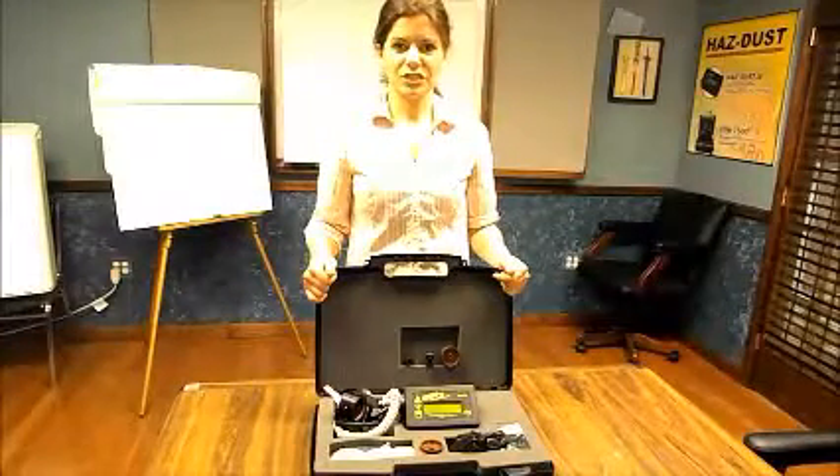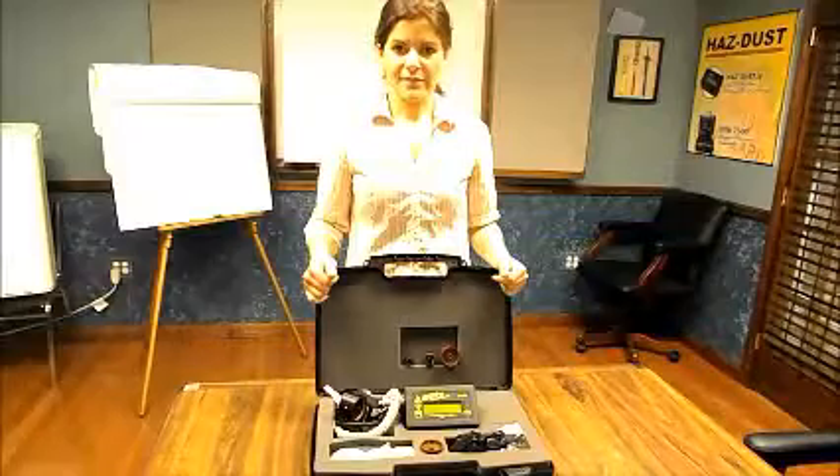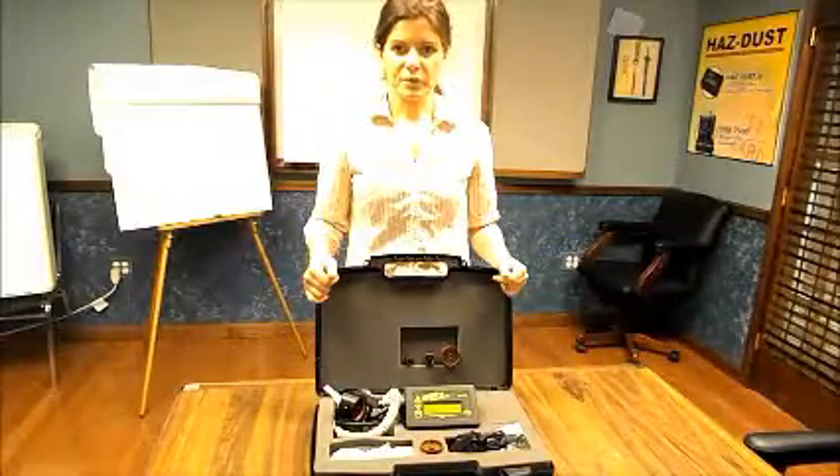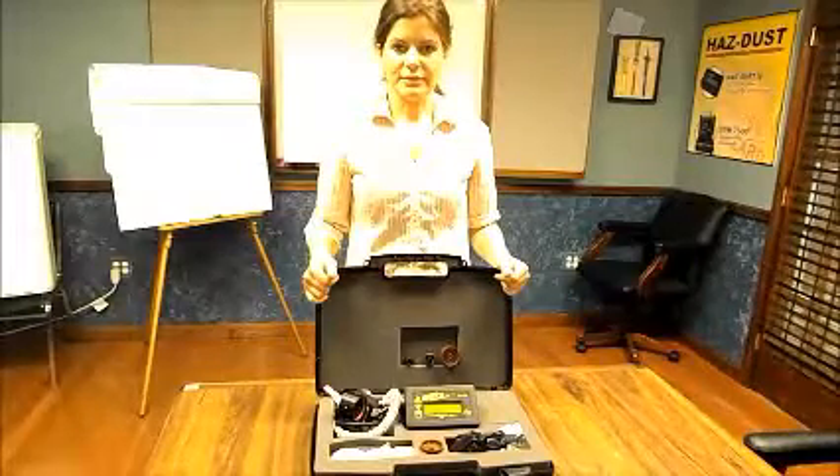I am going to show you how to interchange the sampling heads for the HasDust 4. The HasDust 1004 can monitor for thoracic, respirables, and inhalables.